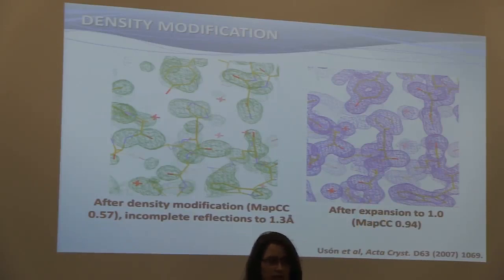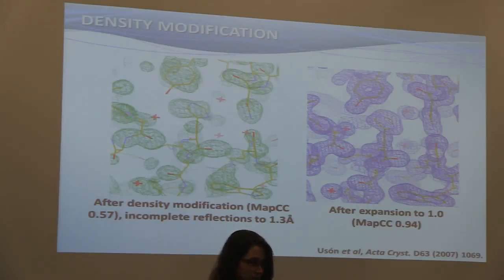also from auto-building. But there are cases where you can't auto-build. For example, if you're working with RNA and DNA. And in this case, I would still advise to use free lunch. Also, free lunch to your native resolution, the resolution of your data set, just filling up the reflections that haven't been measured, is a default in SHELXE. And you need to switch it off if you don't want it.